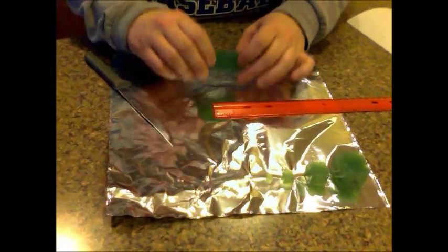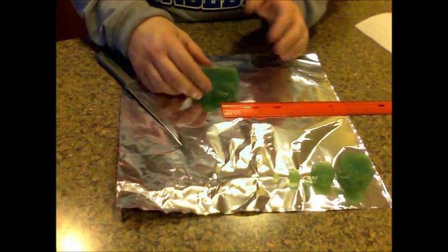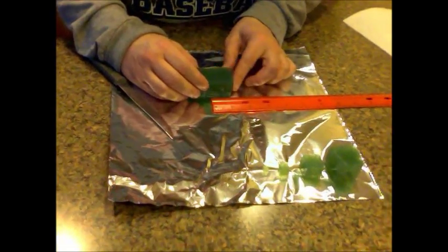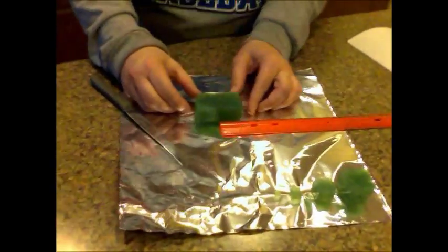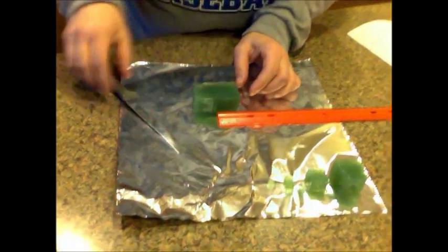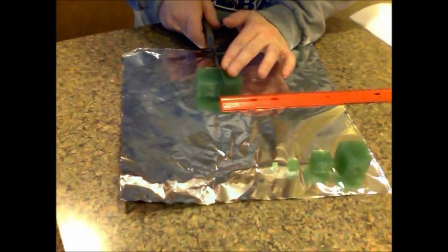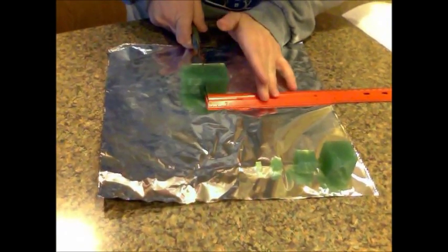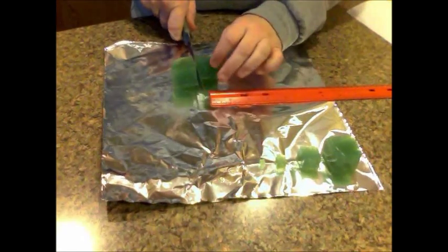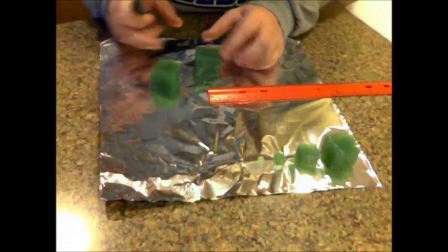To start, take the block you're given — whatever side is the straightest along the end, you're going to line up on your ruler. As long as you're following the guide on your lab paper, you should do okay. You want to line this up so your first cut makes your block three centimeters. This should be pretty close to three centimeters on all sides.